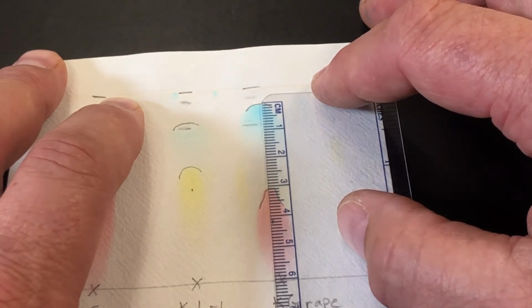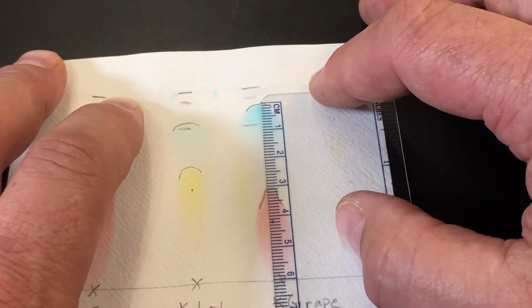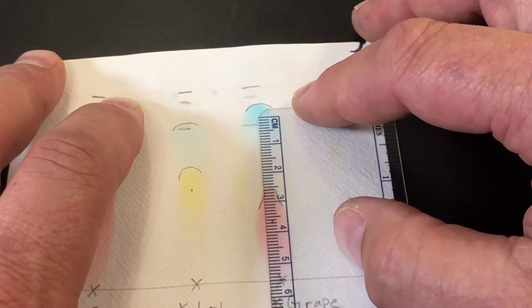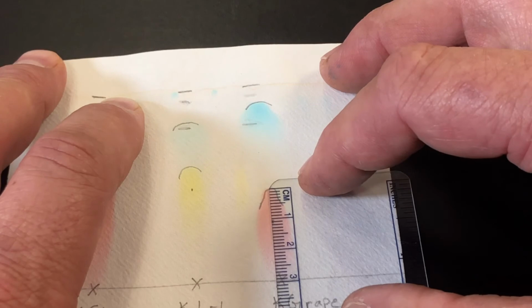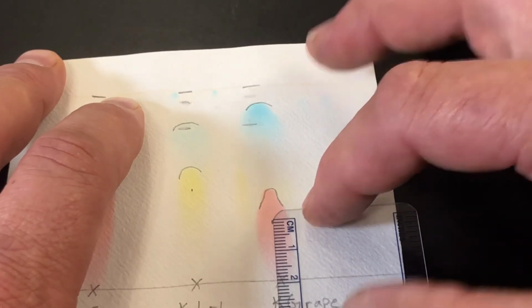So here we go. The tip of that blue is, we're going to say 6.05. And then the center mass of this blue, I didn't make that mark very well, I'm going to make that mark at about 5.50. For the red here, we're going to make that at 2.95. And center mass, we would say 1.90. So those are your data points. Put that into tables and be able to calculate your RF factors.